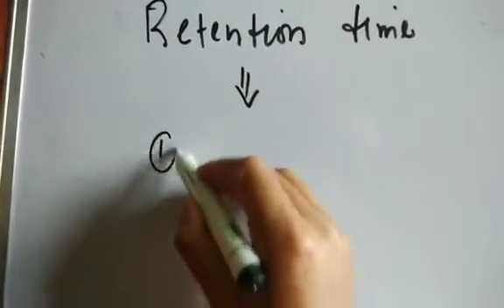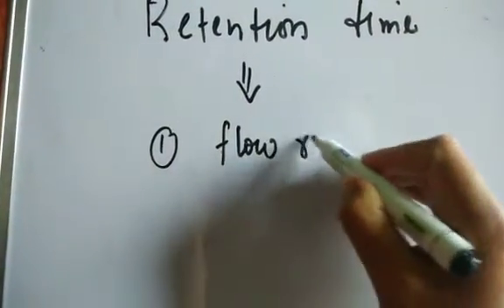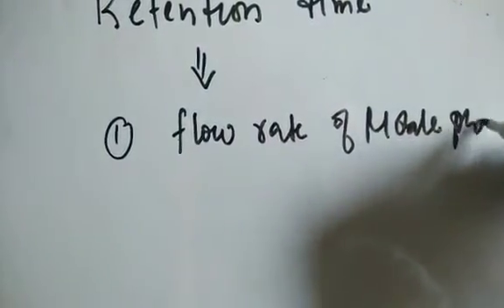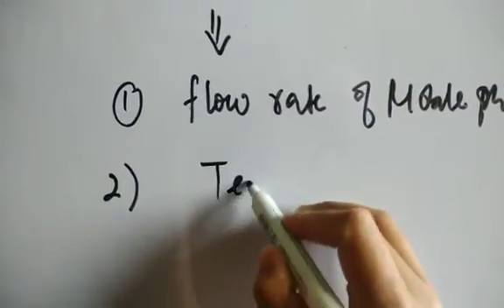Number 1, it depends on the flow rate of the solvent, the flow rate of the mobile phase coming from here. So it will vary with that. Number 2, it depends on the temperature.